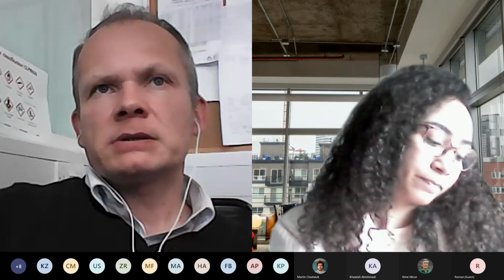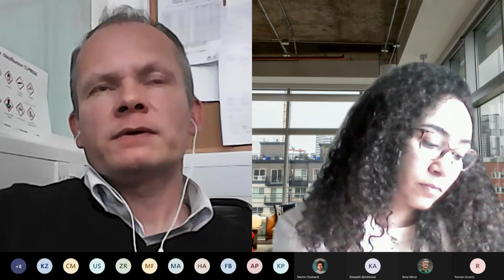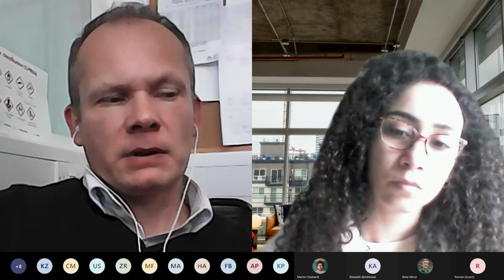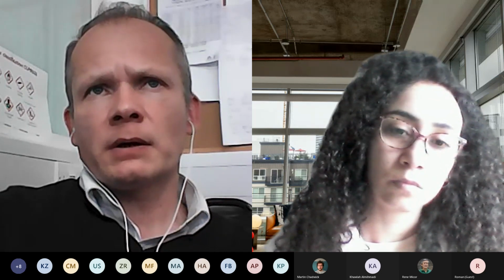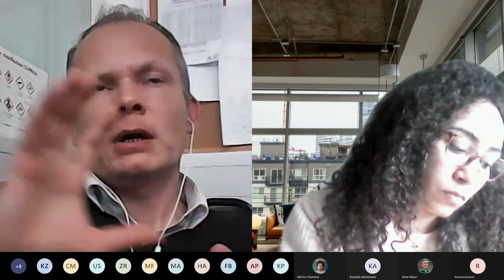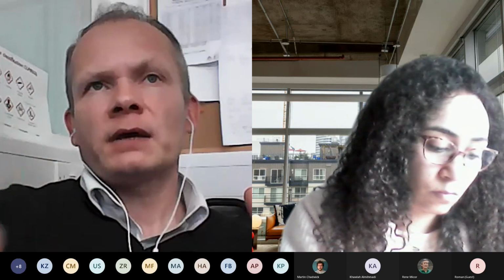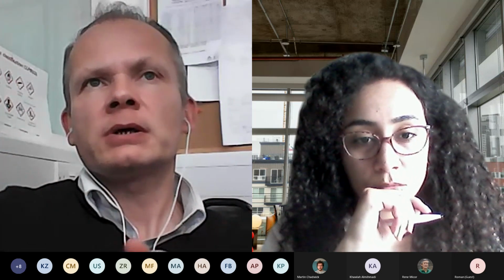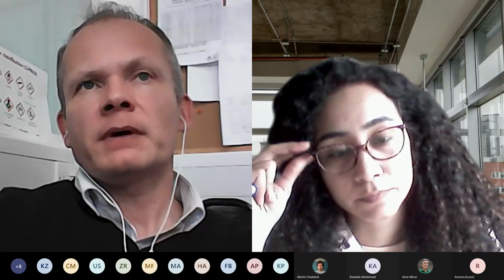Yeah, I think you need a Mastersizer, which is based on Fraunhofer diffraction. If you're familiar with this method, I think it's available somewhere in food and nutrition science. Instead of dynamic light scattering, you measure the total scattering as a function of angle from the solution, and it works very well for large particles. So you just write me an email, and I can provide you more information about Fraunhofer diffraction.